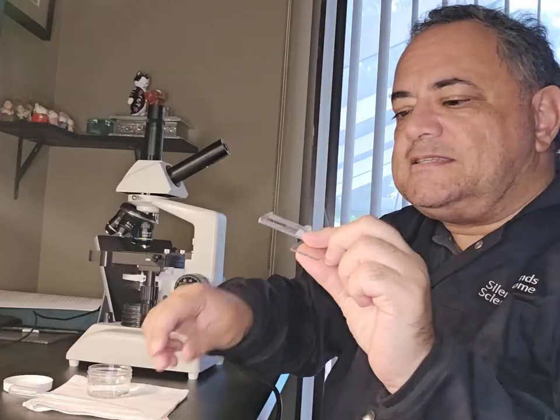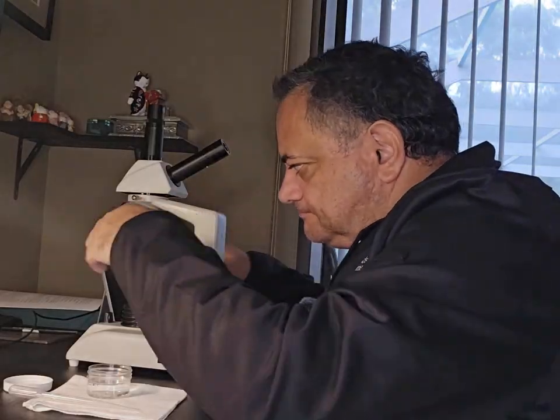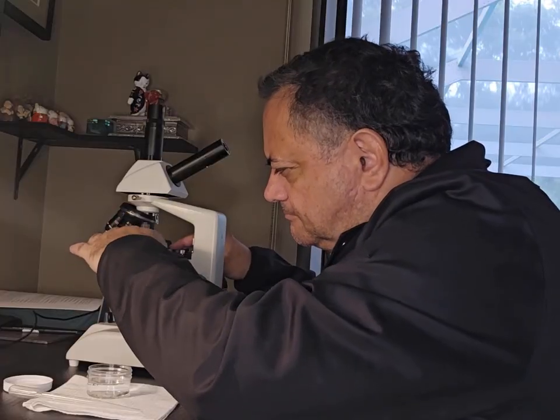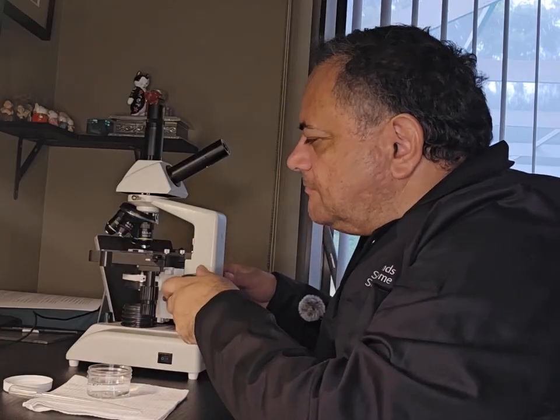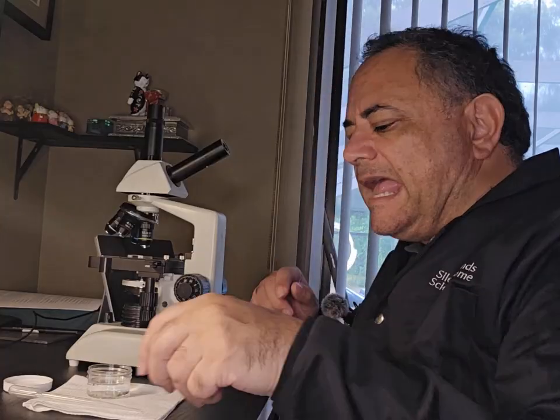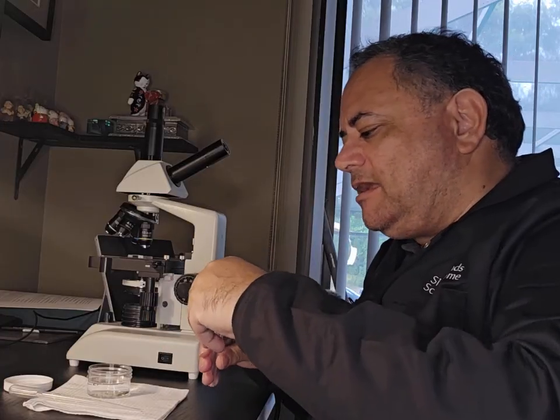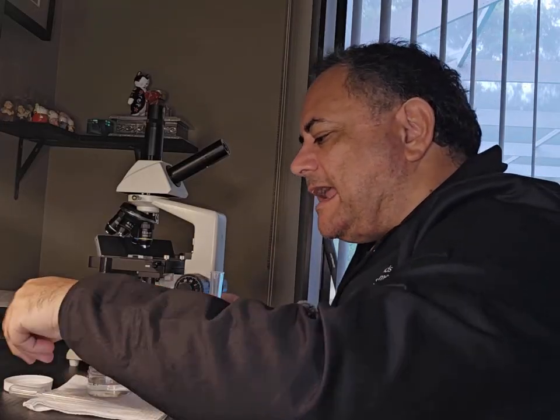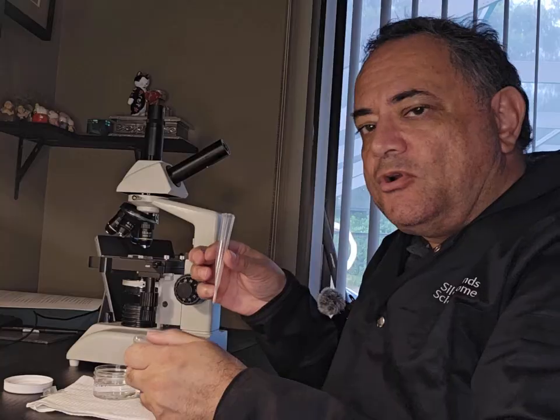So I'm going to fix the slide onto my microscope stage, like so. And then I'm going to put a sampling of my tardigrade culture into my demo slide.